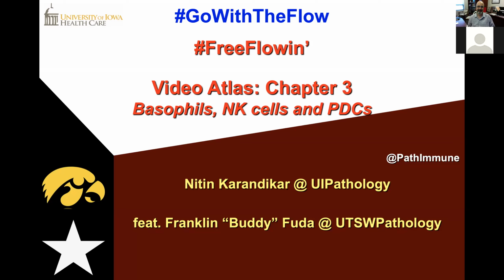Today again we are joined by Buddy Fuda from UT Southwestern, and he's going to talk about a very interesting topic, normal populations of certain cell types that we don't think of but may become important in some cases, and those are basophils, NK cells, and plasmacytoid dendritic cells. So without further ado, I'm going to ask Buddy to share his slides and take over.